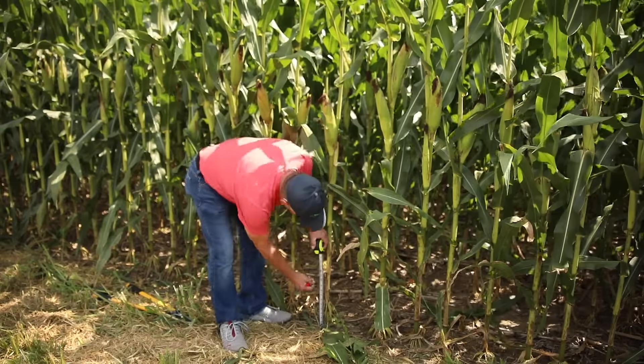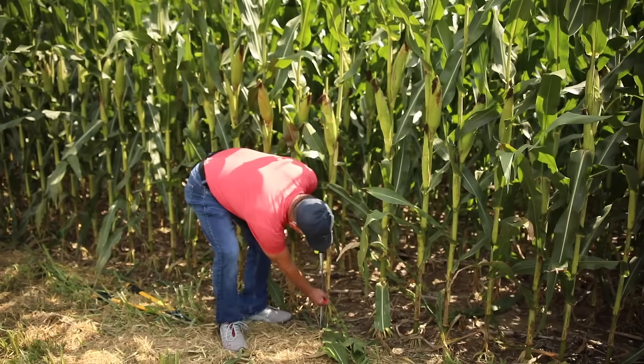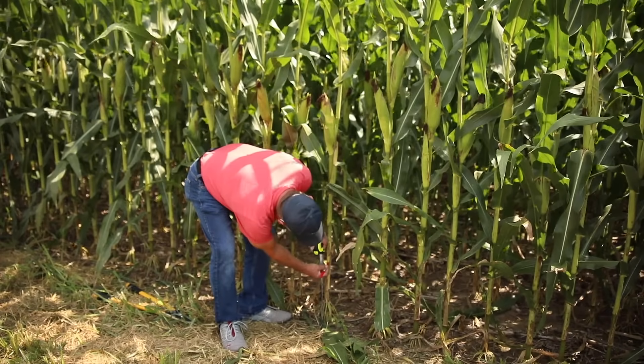I've got a marker — I'll just go to the ground, we're going to mark 6 inches right there, and then go up to 14 inches here.